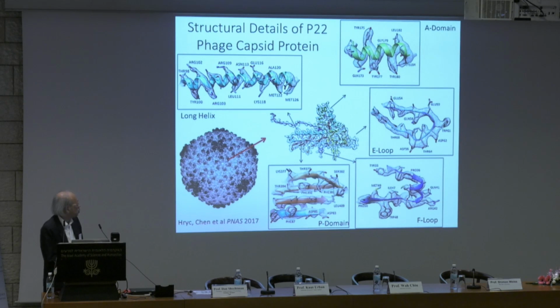And so we build this not only for one protein, but 7 proteins in each of these asymmetric units. The rest of the other 59 asymmetric units look just like the one we built in here. So now, once you get this detailed, we call tertiary structure of the proteins that make up this biological buckyball, and what do we learn from here?